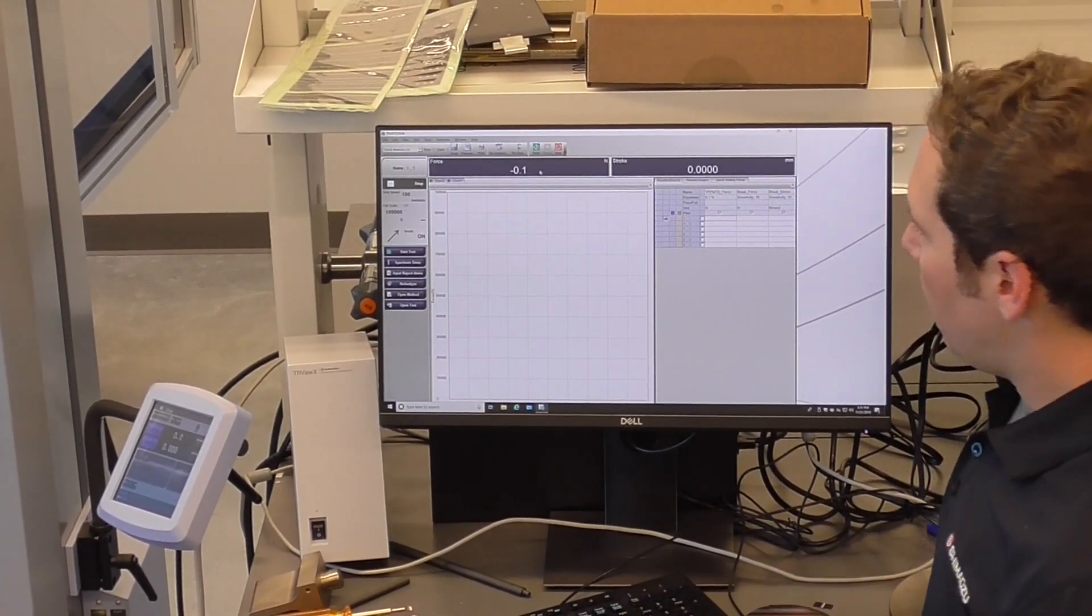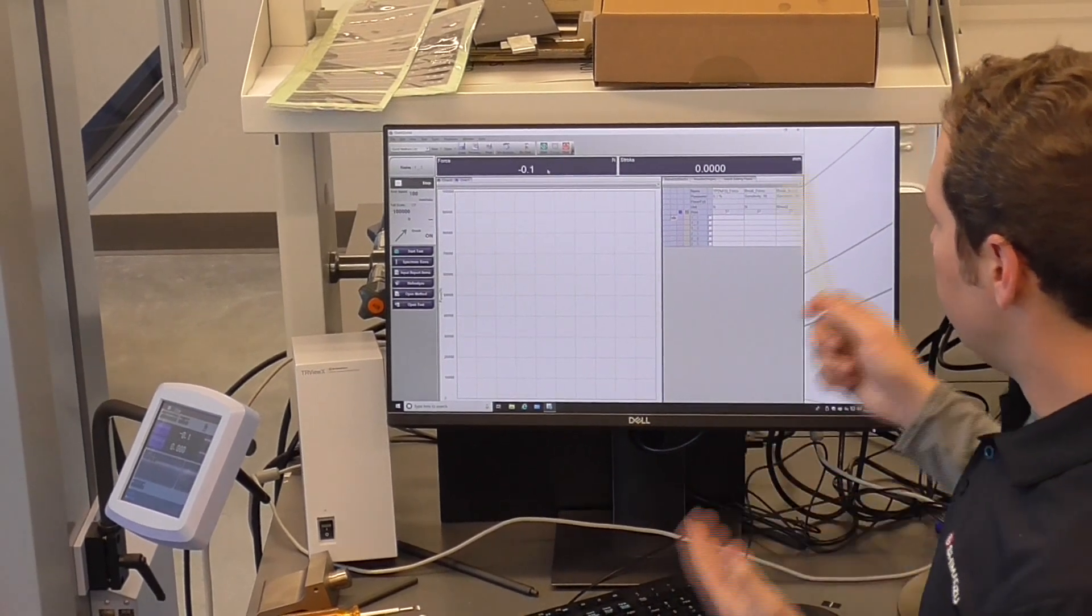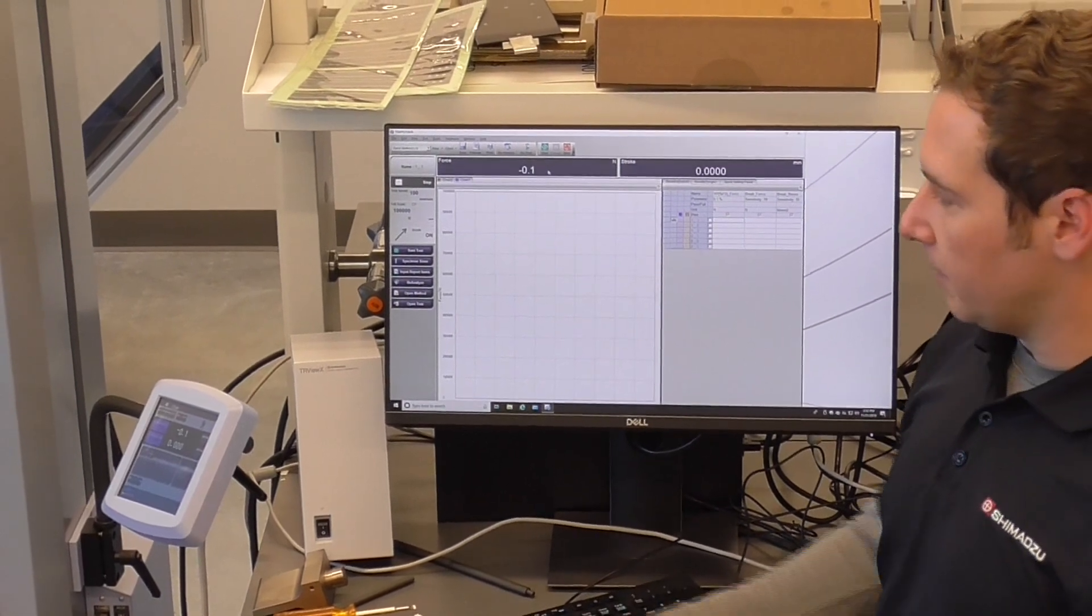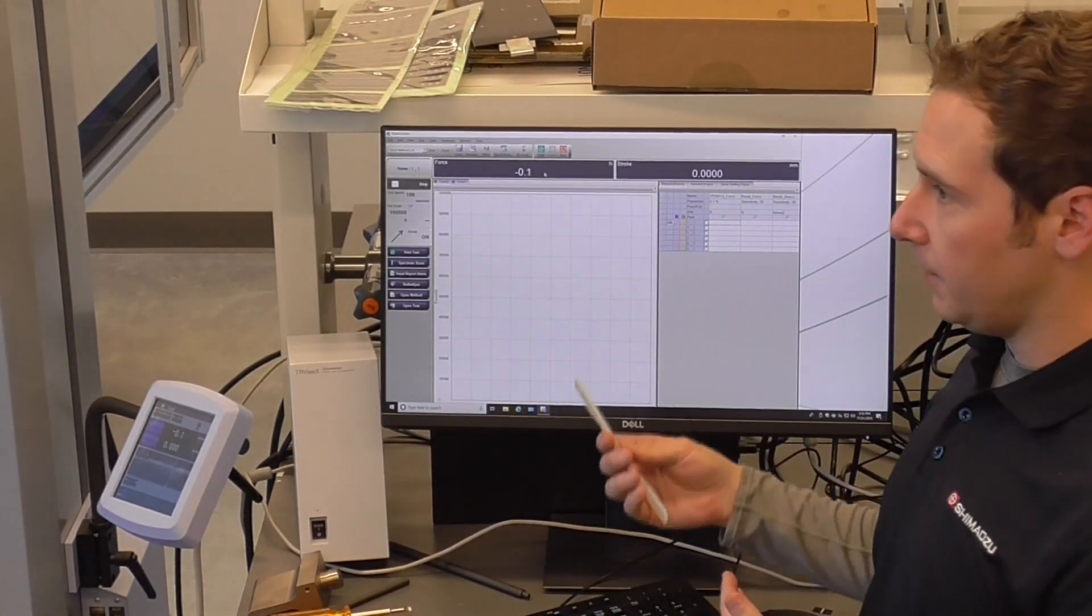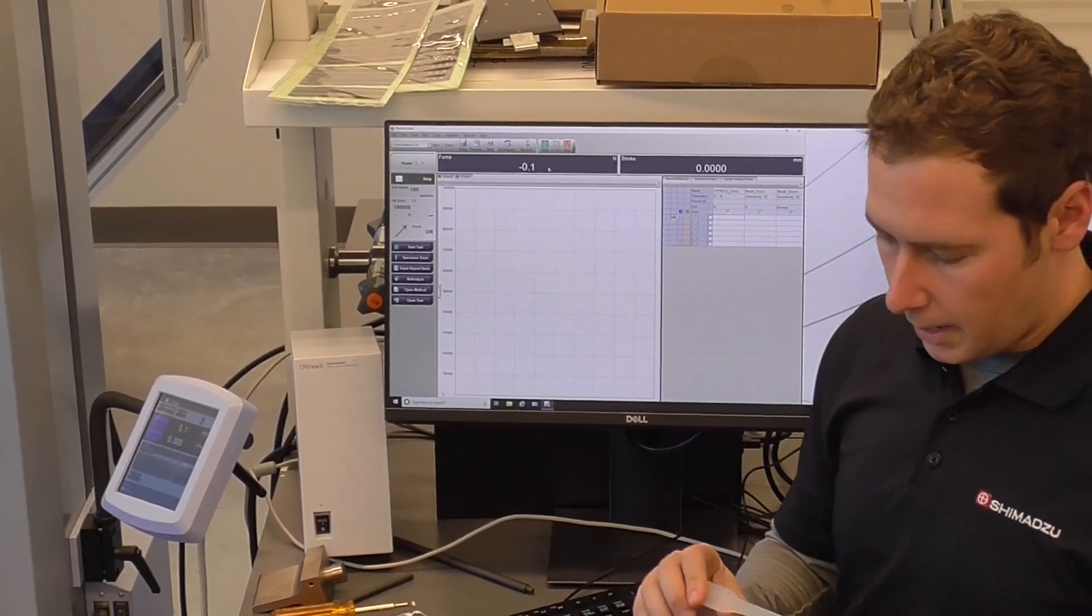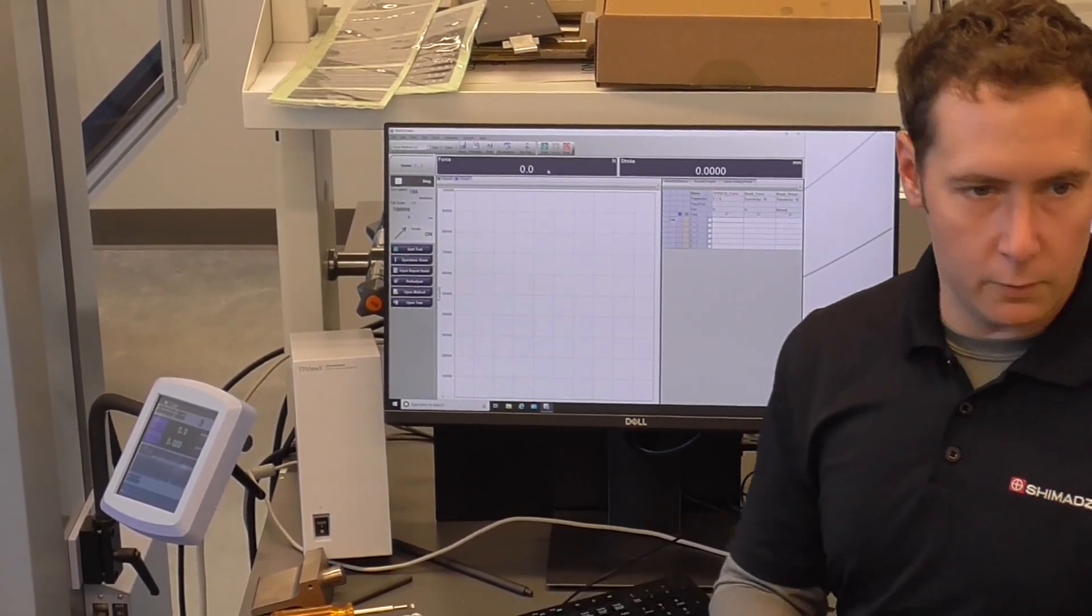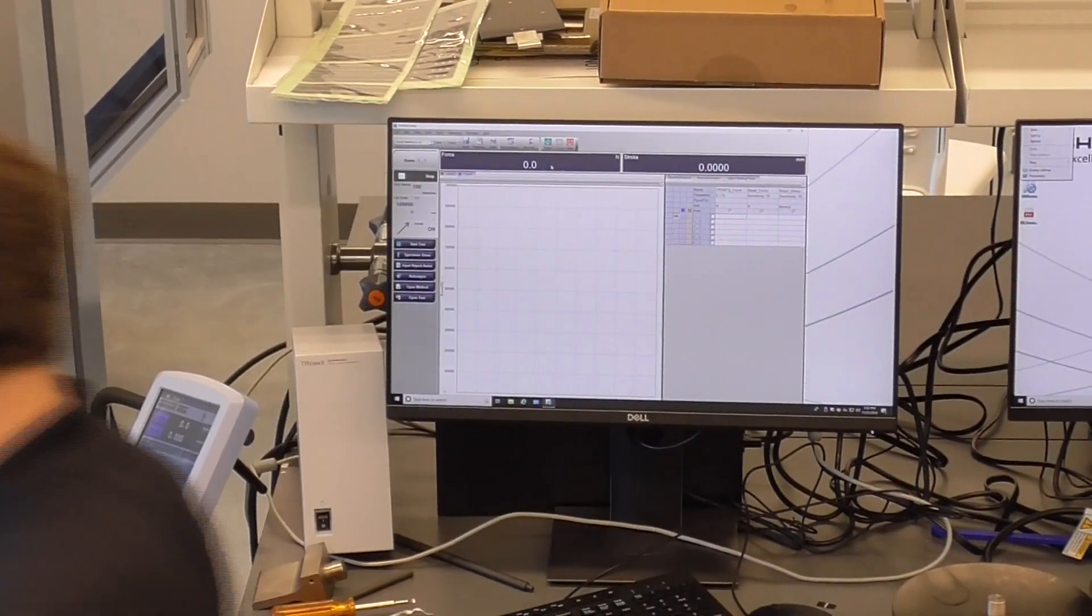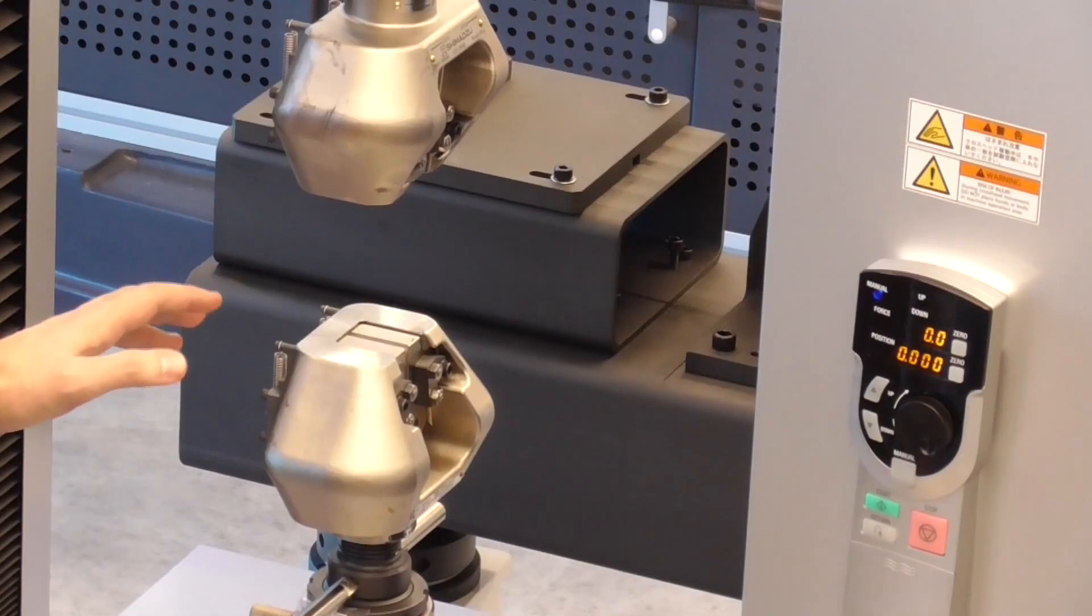Great. So, we have our test parameters loaded. We have our data processing points selected. This is kind of unscientific, but just to kind of complete the workflow of writing method and running a test. We're gonna run this little plastic dog bone right here. I don't really know what material this is. I don't know what an ideal test condition this is. So, we're both gonna see how it does.